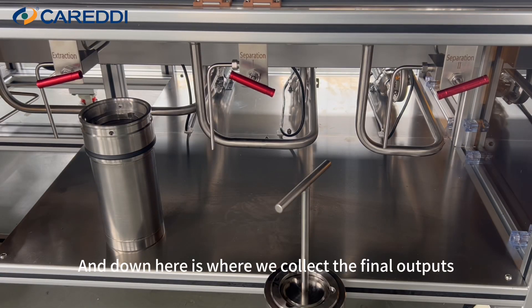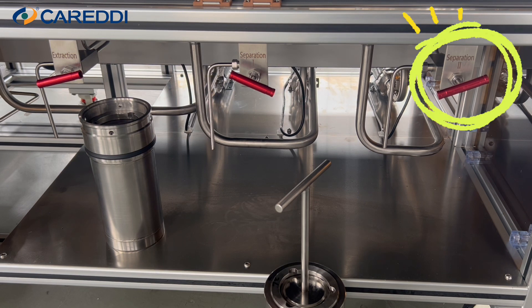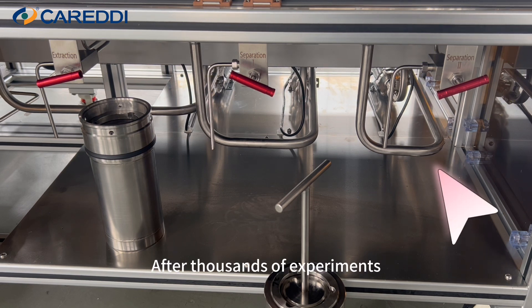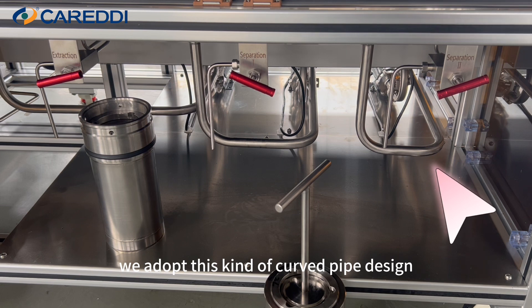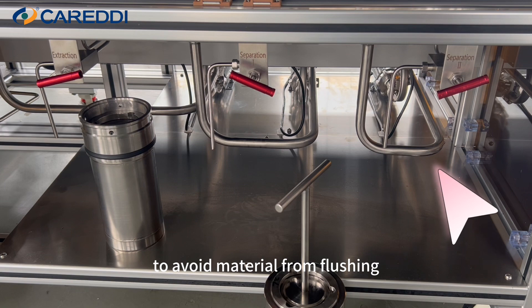Down here is where we collect the final output. You can see the venting valves of extraction, separation 1, and separation 2. After thousands of experiments, we adopted this curved pipe design to avoid material from flushing.